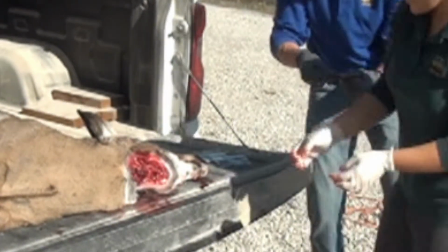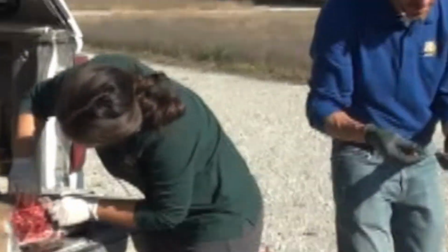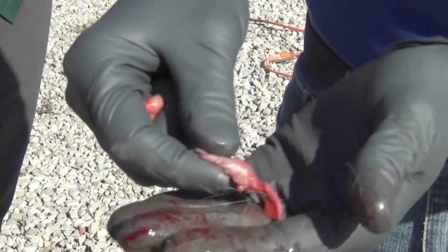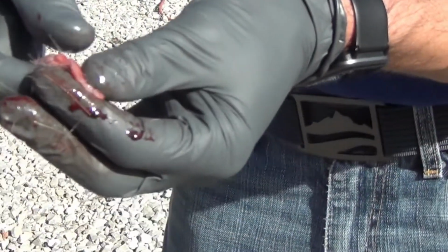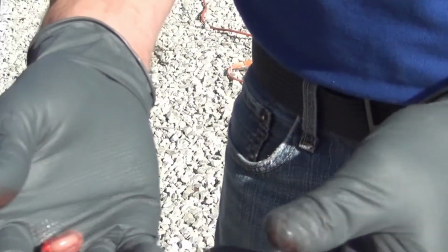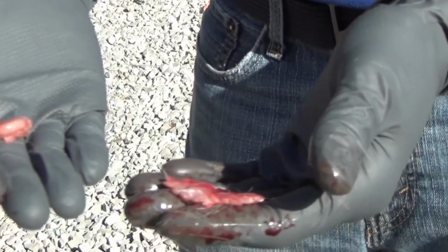So really quickly here, everybody, you can kind of tell the difference of what we're looking for. Like Dr. Rudin said, the salivary gland tissue, which is what I have right here in my hand, is often confused for the retropharyngeal lymph node, and you can see why. They look pretty similar in overall appearance.